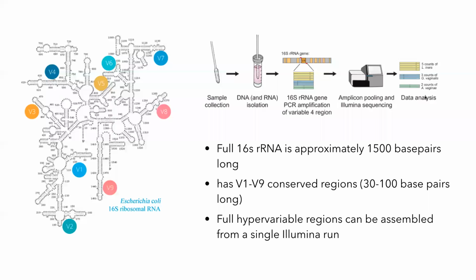And so certain types of samples like water or swabs, they only yield small amounts of DNA, and so we have to amplify the material that we have during library preparation. And amplification by PCR can actually over-amplify some of the material that we have, right, without our control, and that typically can yield a distorted view of the taxonomy that we're looking for.